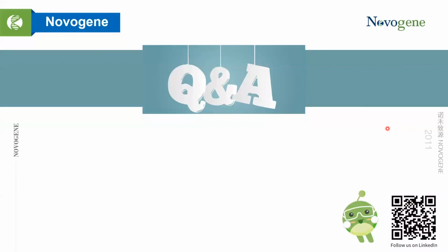Right, so for the next one, I'm going to pick a de novo sequencing related question. Okay, so I found this one. I understand that this is a predominant issue to focus on for de novo assembly, so I would like to answer it here. This audience member asked how to verify the reliability of de novo assembly results.